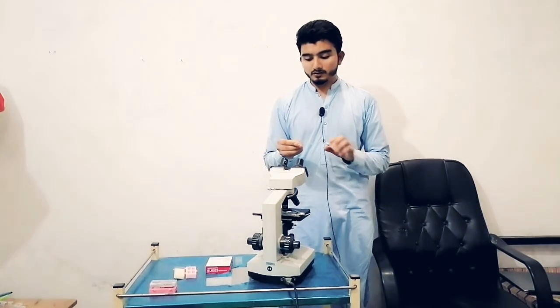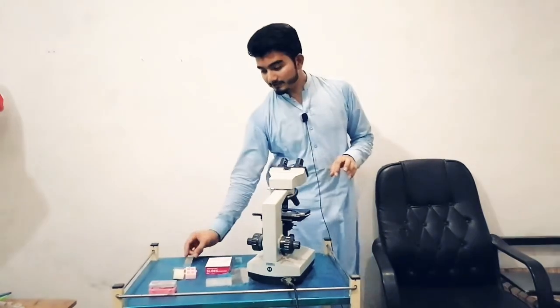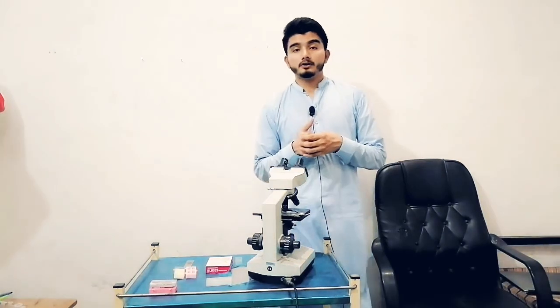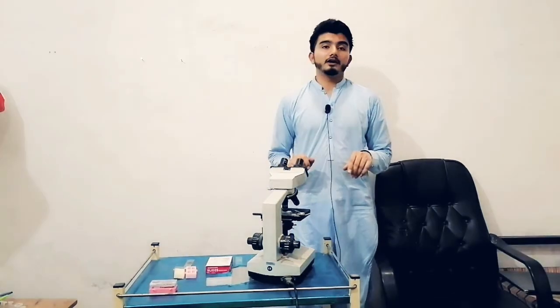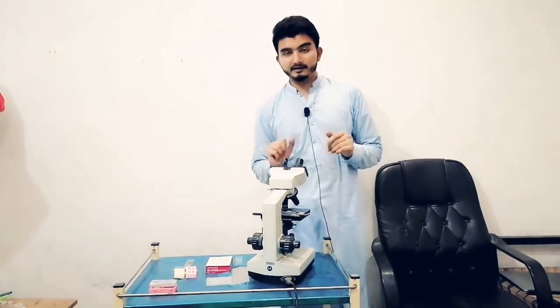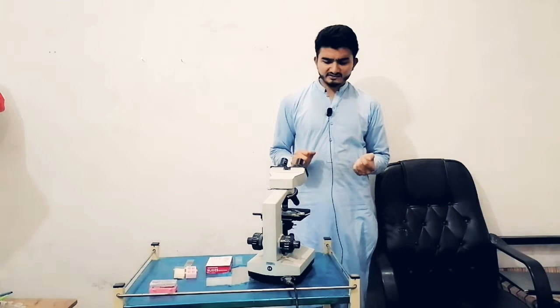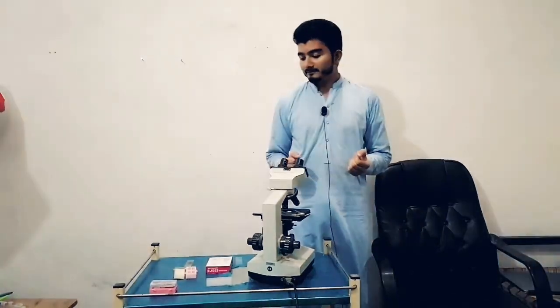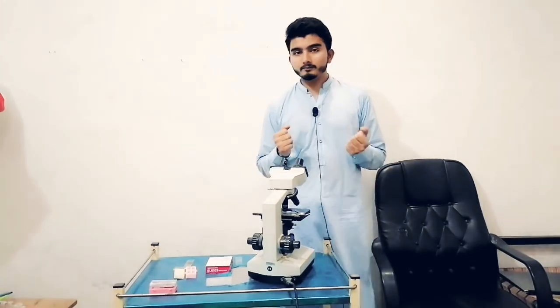During examination on the 100x lens, you should take focus on 100x, and you should set the light high. So it's all about the microscope. And I think urine examination and blood smear examination are very important.